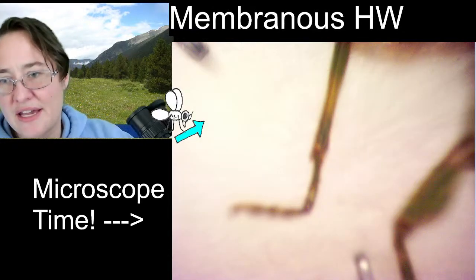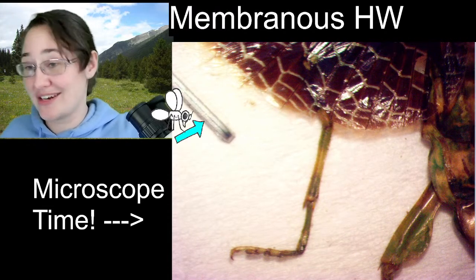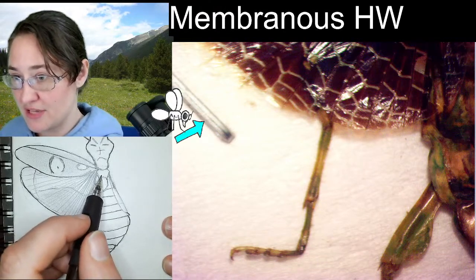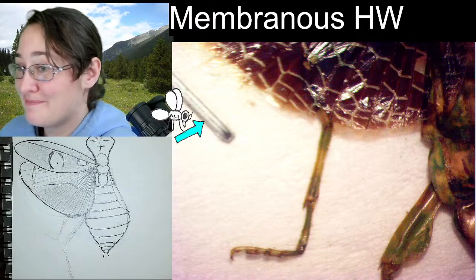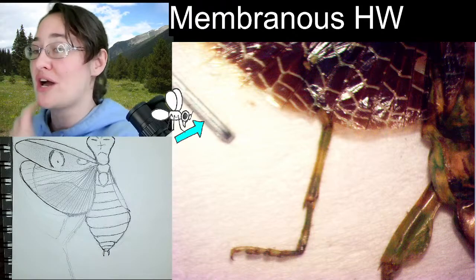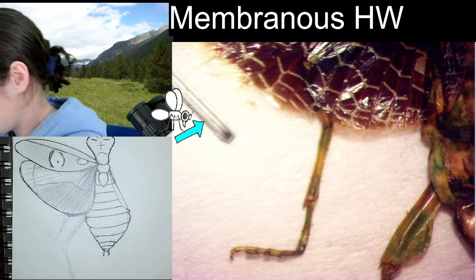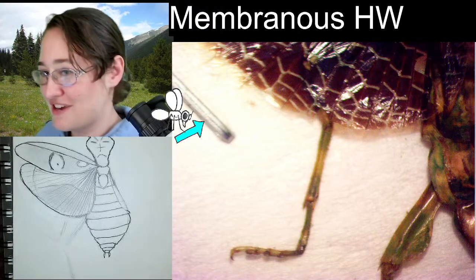So this middle leg, we saw it earlier, it looks like it's coming right out of the wing. I promise that it is not. It's connected up here to the mesothorax, this middle segment of the thorax. It's not technically connected to the mesonotum, because the mesonotum would be on the top. The legs are connected to the sternum, the bottom. So you could say that the middle leg is connected to the mesosternum. Just trying to up the language here every now and again.